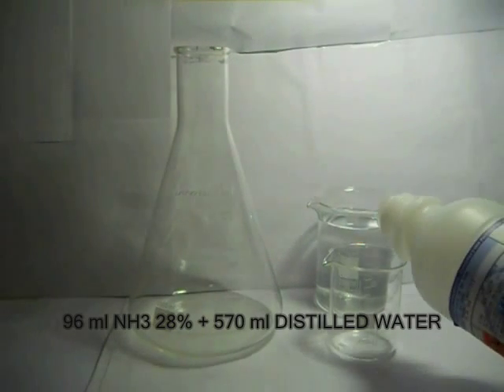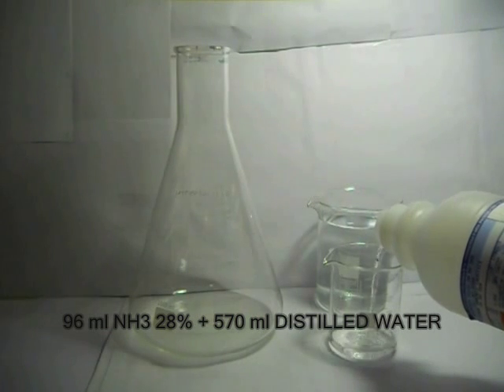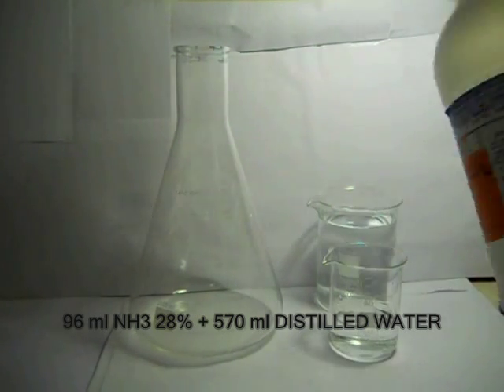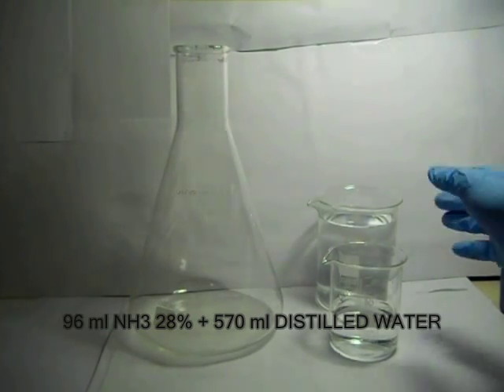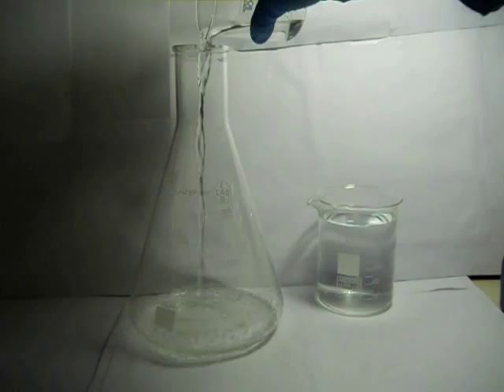Now, for the last part of the reaction, prepare a 5% ammonia solution by adding 96 ml of 28% ammonia to 570 ml of distilled water.